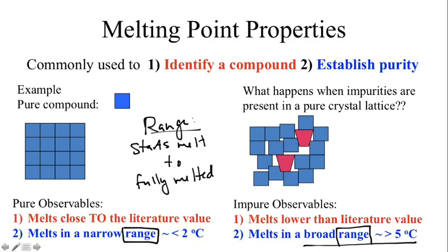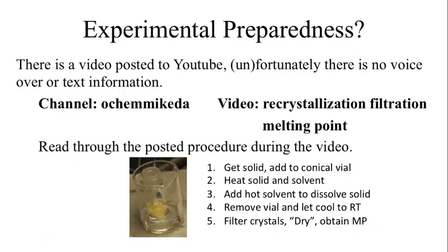It looks like a liquid. When it starts to melt, it can actually be a bit tricky. It really just requires a bit of experience watching different compounds melt to figure that out. But I can help you out a little bit with that. On top of this video, I would recommend that you watch the melting point video, which is found under, I believe, Organic Lab Techniques.